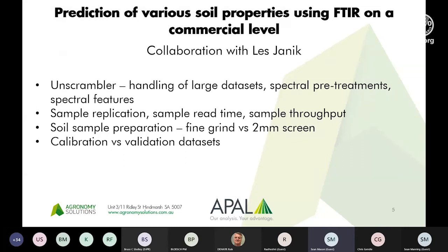The directors called the instrument a commercial lemon as it came to us on the bench. As it's been alluded to, we need at least four replicates per sample. The actual carousel that it came with had 60 spots, so we could do about 15 samples in terms of loading. On a commercial level, when we're seeking high throughput of samples per day, and peak periods in the thousands, that was really difficult to handle. So we've built instrumentation to handle that.